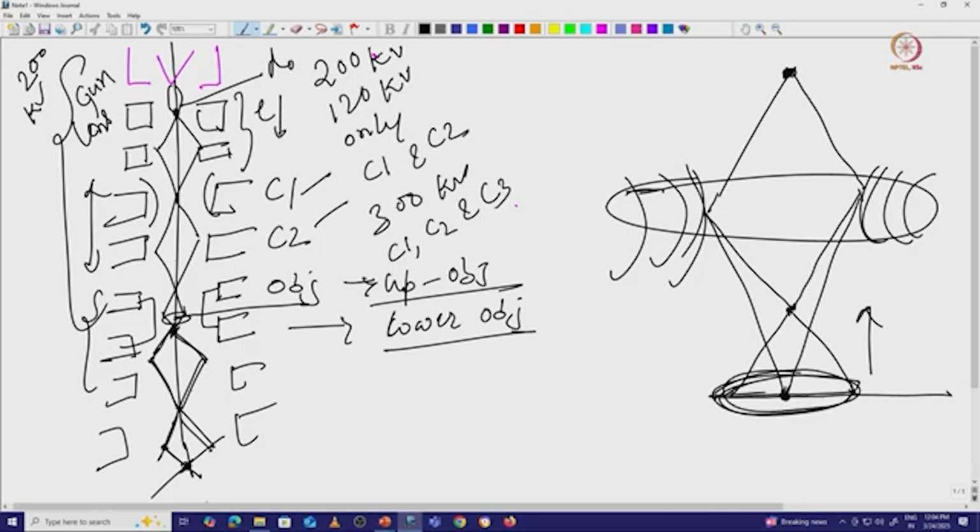So you can measure the beam diameter from here. In this case, these electromagnetic lenses are fixed. It is not like the glass lens of an optical microscope, where whenever I want, I can change the position of the glass lens and get a magnified image.